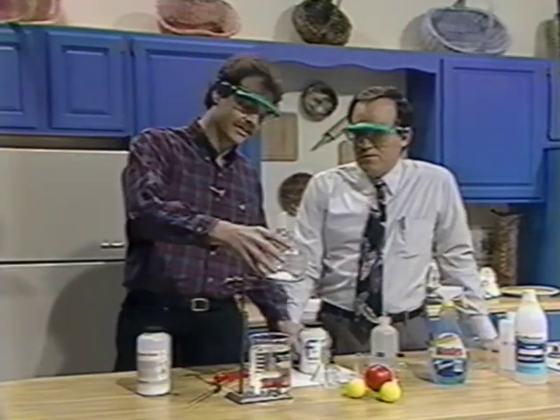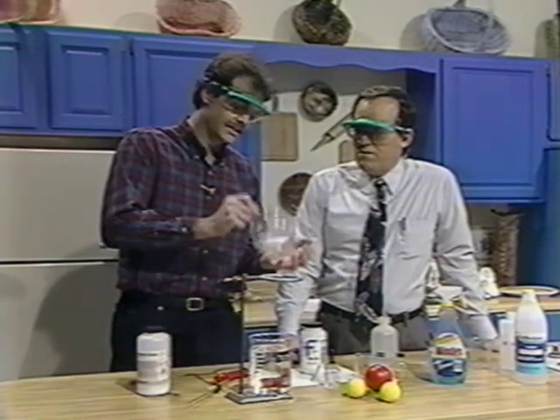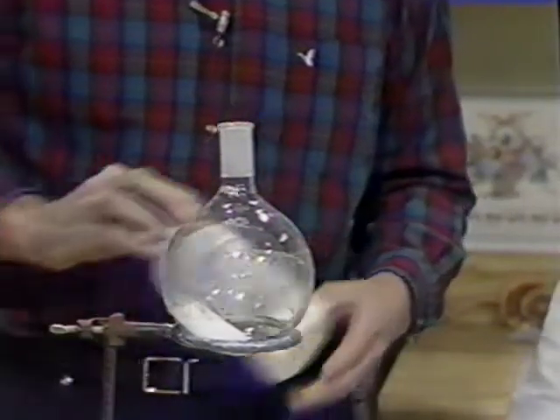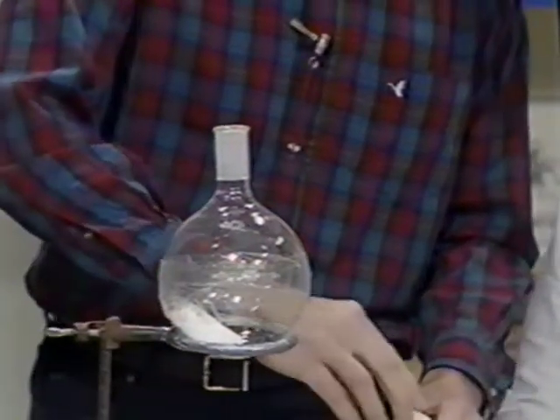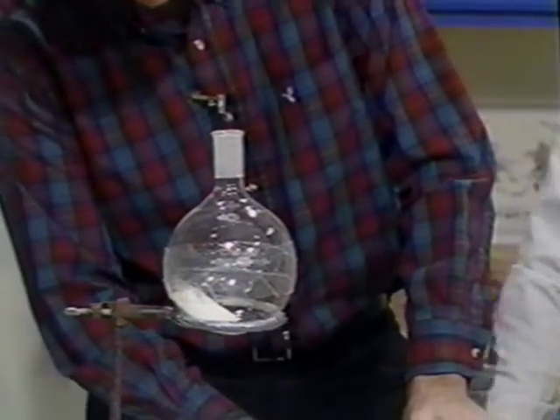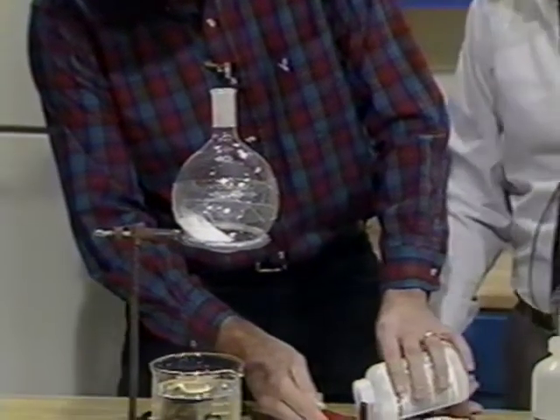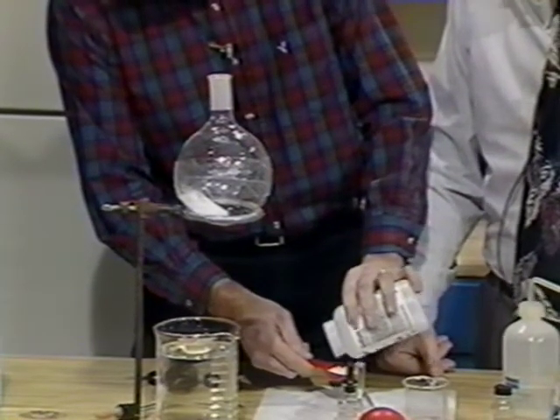In our flask here I have ammonium chloride — it's a chemical reagent with various uses. I'm going to mix with it about a tablespoon of sodium hydroxide, commonly called lye or caustic. We don't want to touch it with our hands, but it's fairly safe to handle like this.